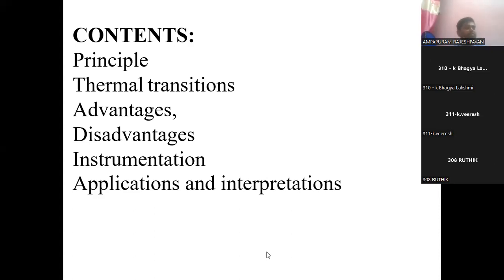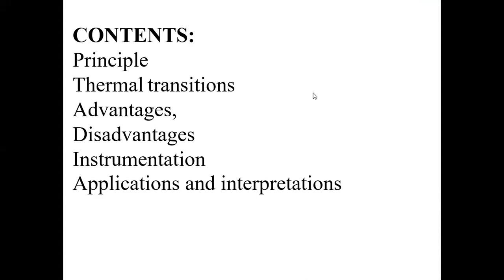So, next we are going to study the first topic of the fourth chapter, that is about DSC. In this DSC, we are going to study the principle, thermal transition, advantages, disadvantages, instrumentation, and applications. If possible, we'll see some interpretation.